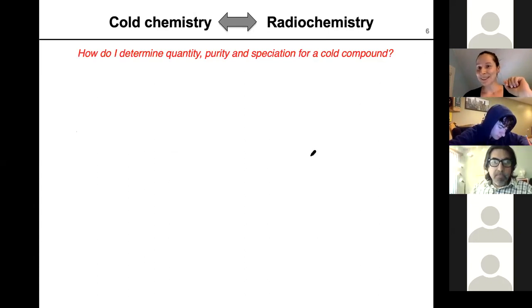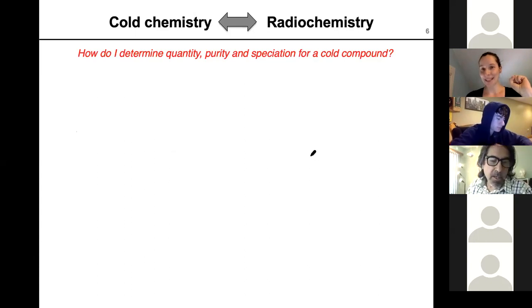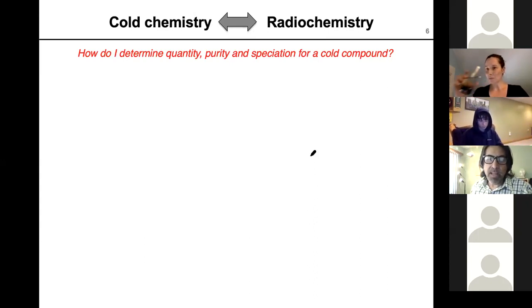So, yeah. Could I add one thing? And it's cost. In our company, cost covers several of the categories that you talked about. When you're working with radiochemical reactions and things bind to glass, what we use is we scale everything down into cartridges. So rather than pour a column where you have some sort of chromatography occurring and you collect it, it's pushed through a really, really small column. That way you can have a very small amount of products going in, reactants coming out, you reduce the exposure of personnel, and that whole thing saves you time. And when in a company, when you save time, you save money. That cartridge saves you a lot of effort and time, which you then bill to someone else. But the bottom line is that several of those things all come together with cost. Yeah.